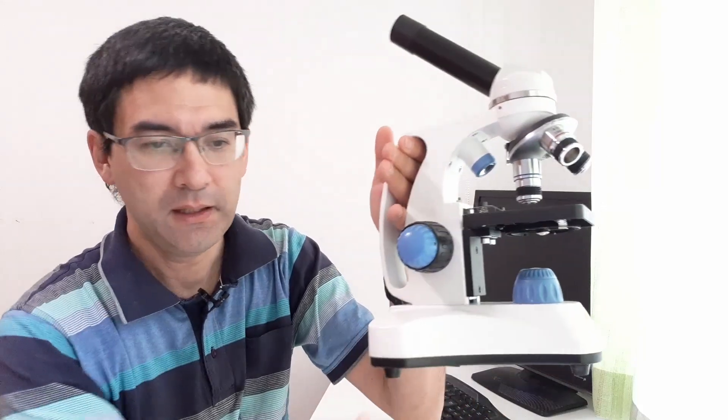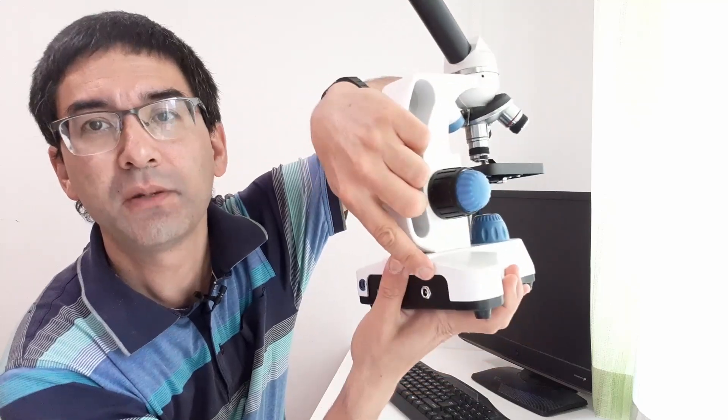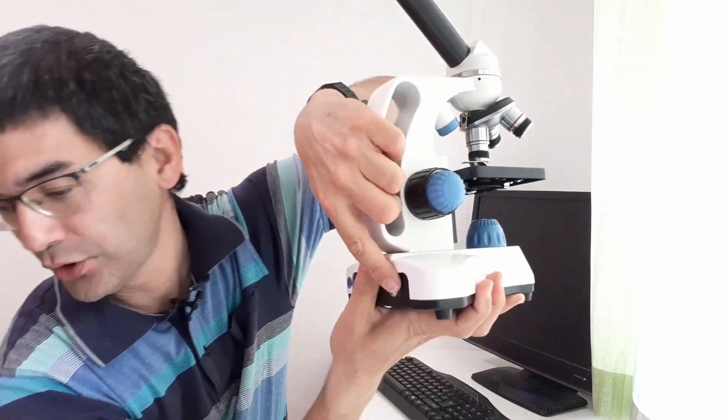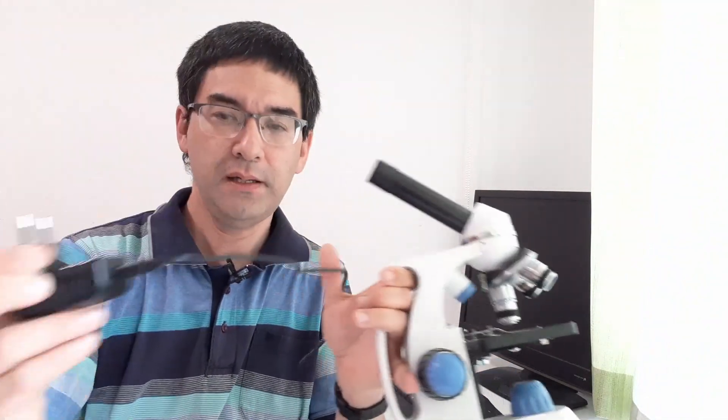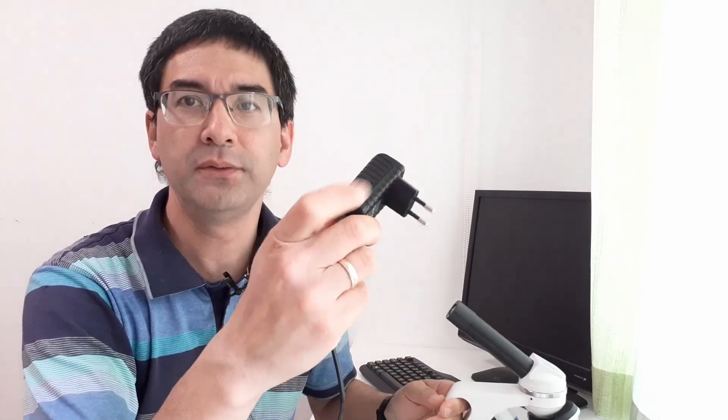It's battery operated but on the back here you can see that there is also the possibility to plug in a power supply. So here is the power supply. It's USB, that's nice, and on the other side you can plug it into the microscope. I have not tried it yet but I think maybe if you plug it into a computer it should also work.